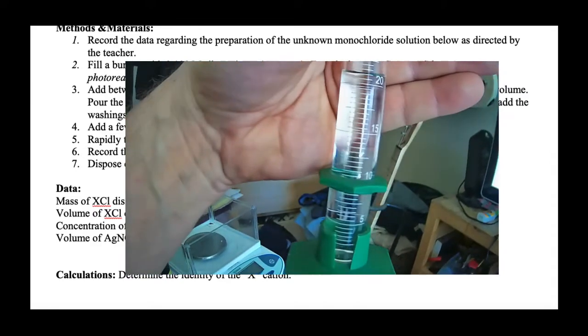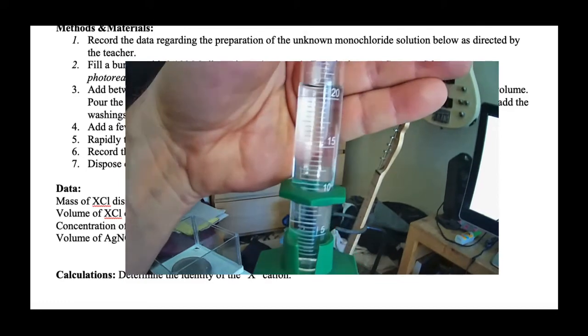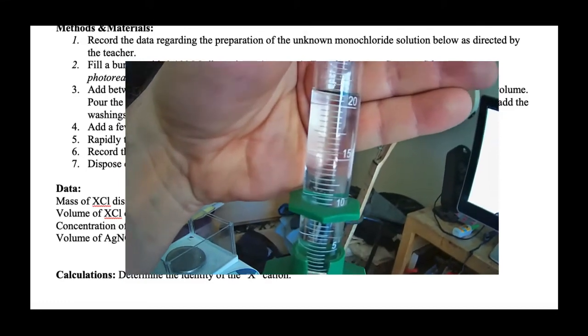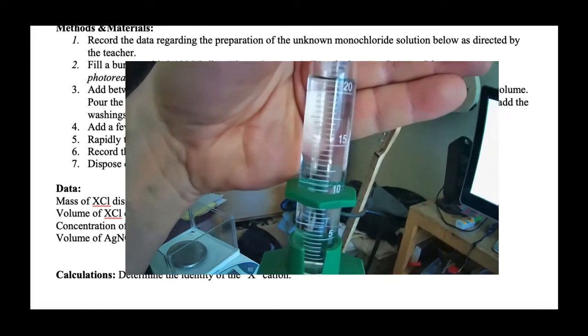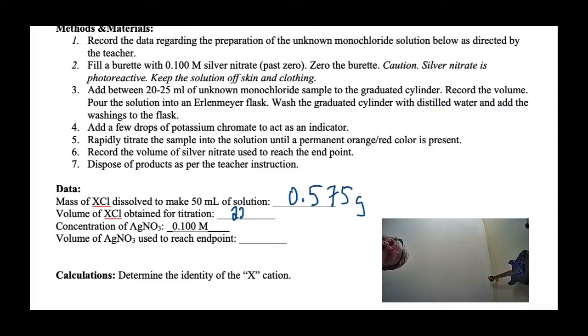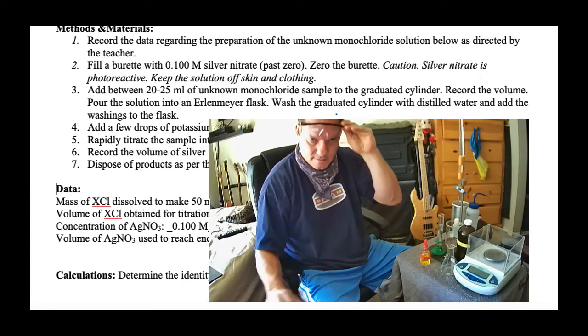I'm going to go with 22.4, maybe. The last one is obviously the estimate. This is past 22, not 23, so 22.4 seems like the right measurement. So I'm only analyzing 22.4 milliliters of the solution. Originally it was 50 milliliters, so there's only a certain part of this that's going into the analysis.